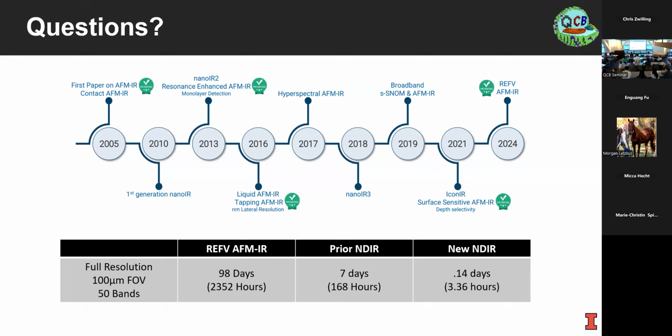That's what we're after. But the field is so new that there isn't a metabolite database in the mid-IR, right? There isn't a way to measure 20 nanometer volumes in any reasonable speed. There isn't a way to connect those two with AI. So again, those are things that all the three students are working on. Okay, and we can talk on. So we love your insight and input into this, because getting this kind of question at the initial stage of development will perhaps help us pause and solve something, do some experiments, go to the next step, go systematically, right?